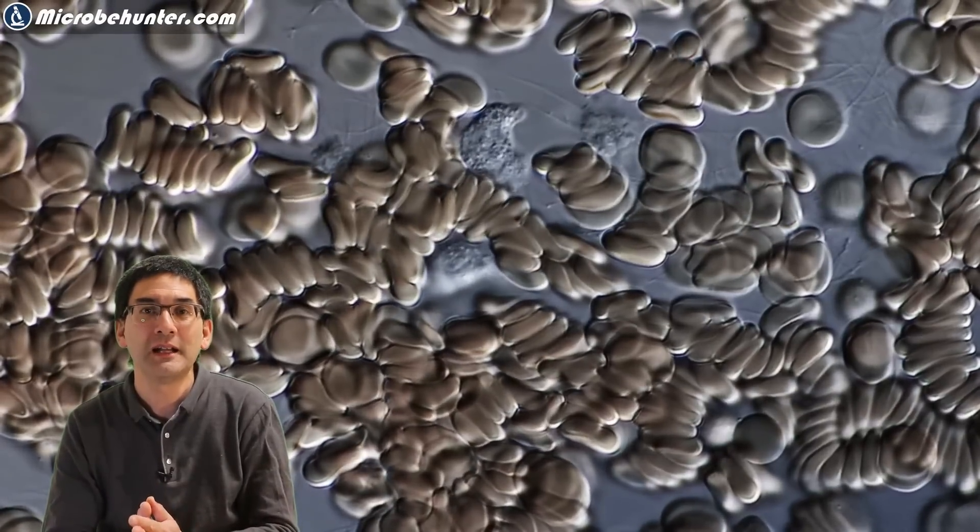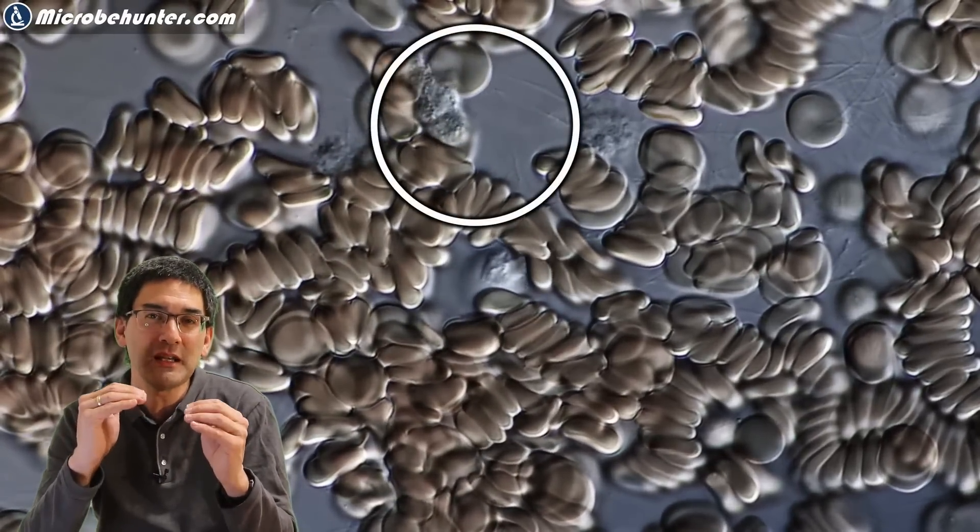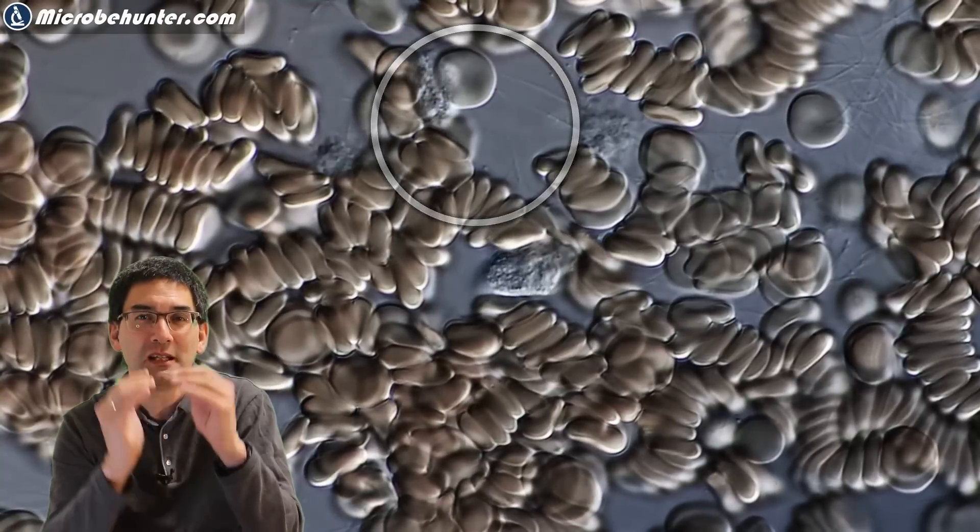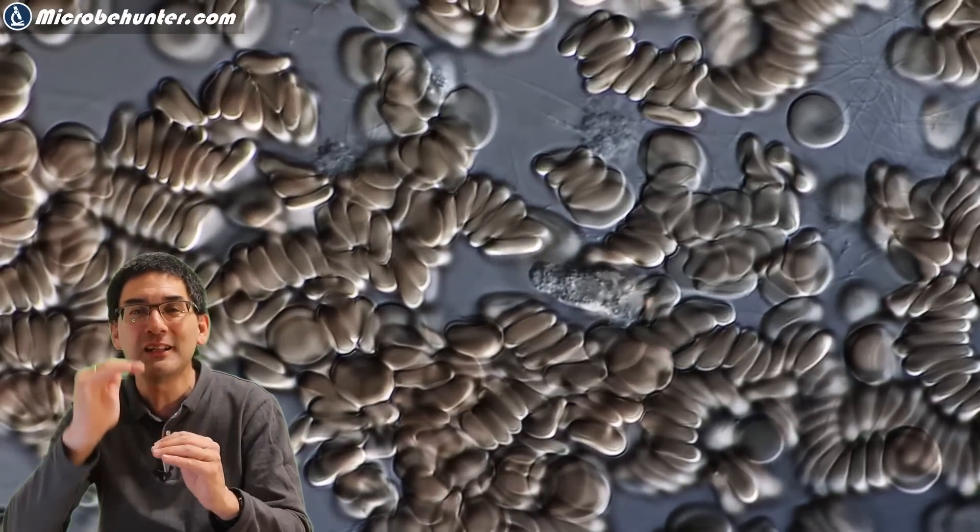Here are a lot of red blood cells, and sometimes it is difficult to see the phagocytes because they essentially attach themselves either to the top surface of the cover glass or to the microscope slide and then they go out of focus a little bit.